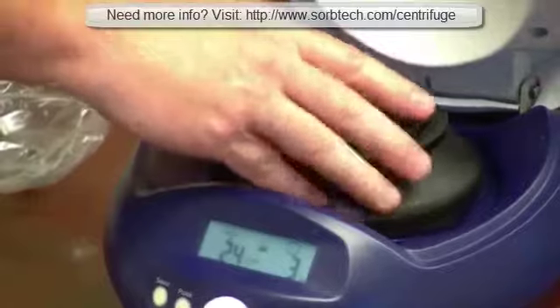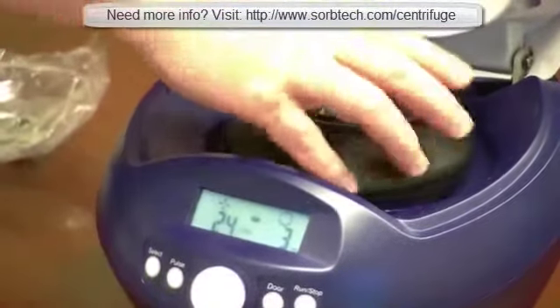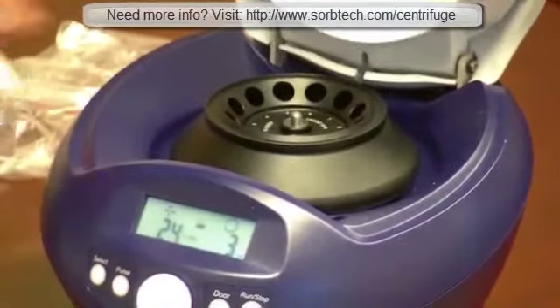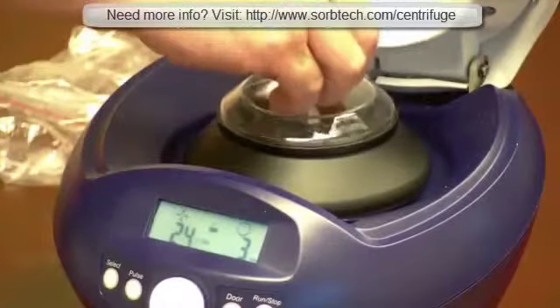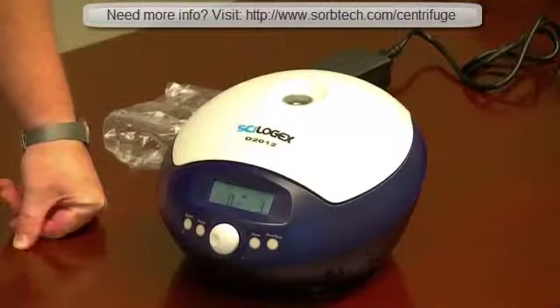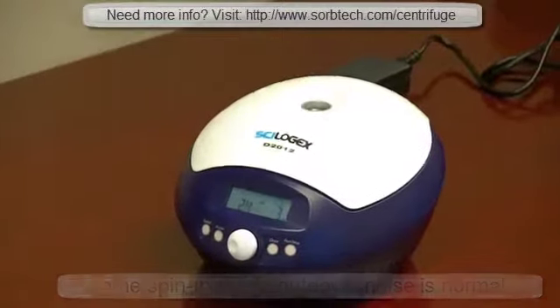This is a 12-place rotor. Notice how quiet it is.